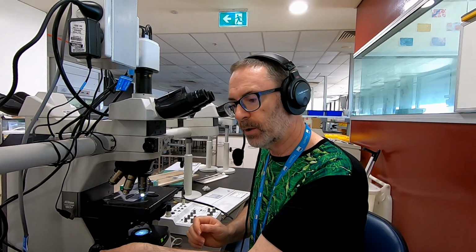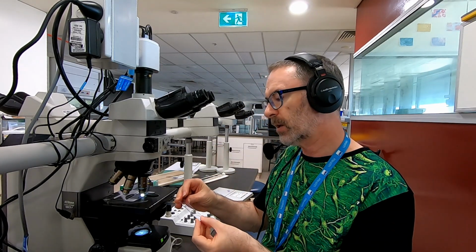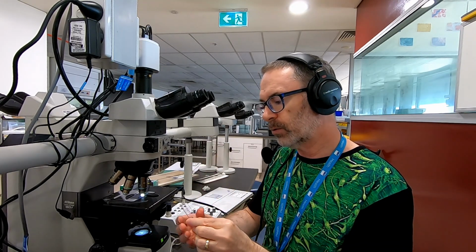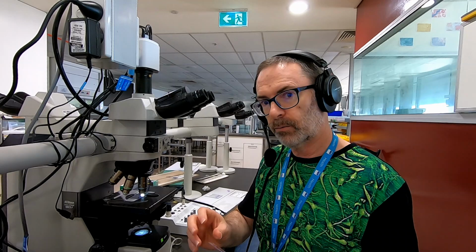So what I thought I would do in this first of two videos this week is to look at some of the chemical structures which are responsible for leading to these variations in staining properties of mucous substances. And then in the second video that I'll also release today, we've got some really nice sections through the digestive tract, starting with the tongue, working our way through to the large intestine and even some rectum. By applying the PAS and the Alcian blue stain, we get a better feel for how there is variation in the composition of these acidic and neutral mucosubstances as we move through the length of the digestive tract.